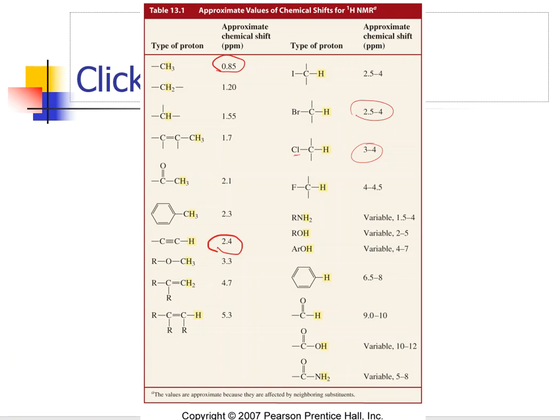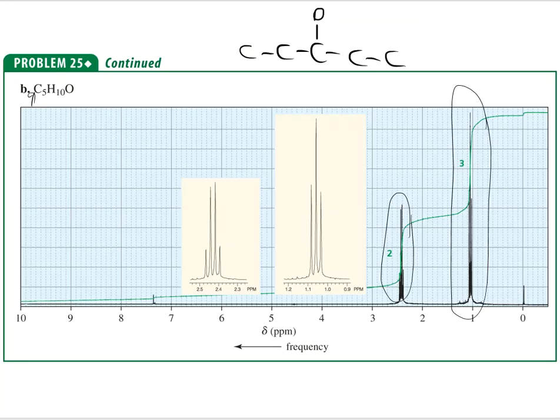All right, so now let's take a look at the example problem they gave us to see if we have an actual chemical shift between 2 to 5. Now, that's a pretty wide range, isn't it? All right, so here we are. So 2 to 5, yeah, I actually see a chemical shift that happens here. So there's a possibility that that is going to be an alcohol group. I don't know that yet, but it's plausible. I can't just immediately forget about it.